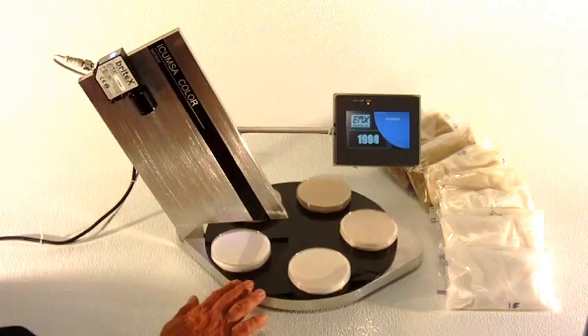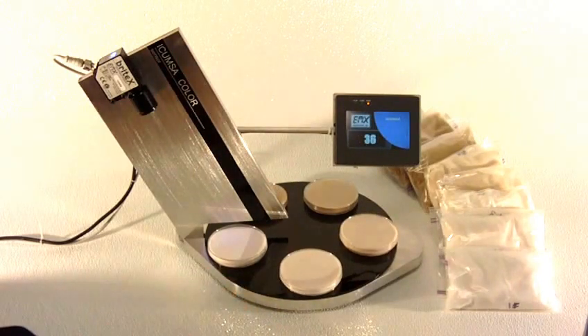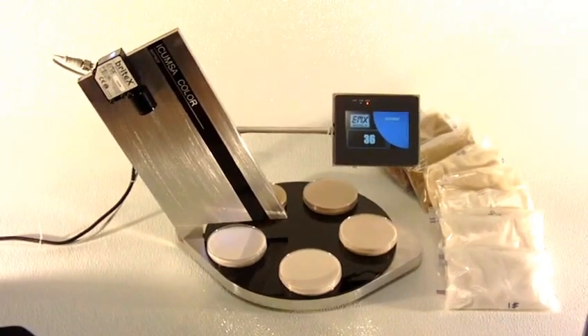So the sensor output, as I said, is a 0 to 5 volt analog signal. It can be connected to any external equipment that can take an analog input, and those levels can be correlated to ICOMSA values and shared with other processing equipment in a facility. And that is the demo for the BrightX 1000S sugar sensor.